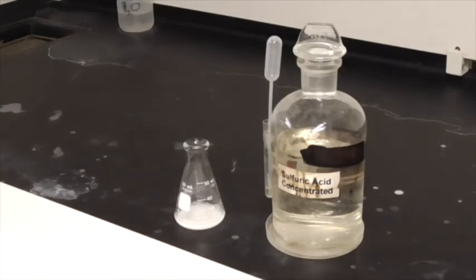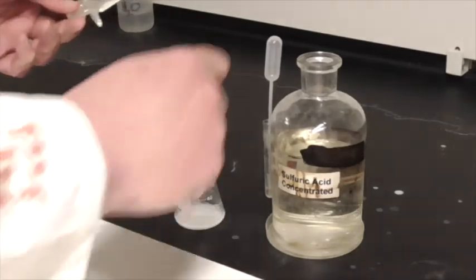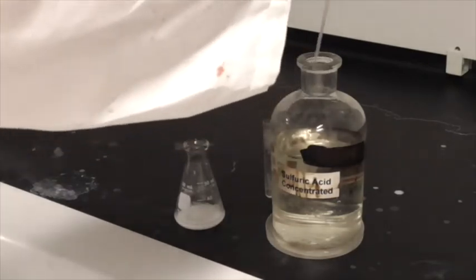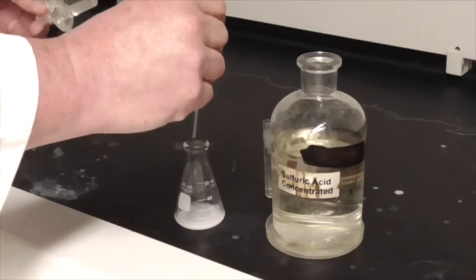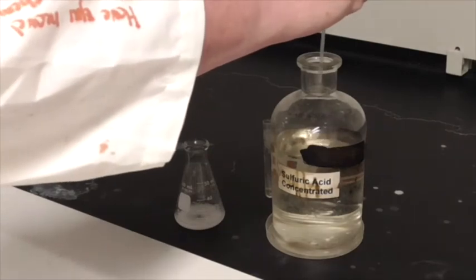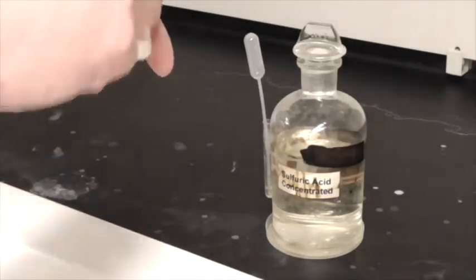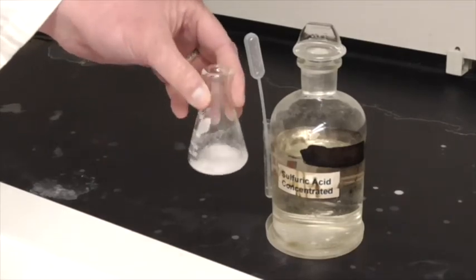So we're at the hood now, because that's where the sulfuric acid is. Sulfuric acid is very corrosive, and this is concentrated, so this is really, really corrosive. So we're going to not get any on us. So we just need to add 5 drops. 5. There's 5 drops. And we're going to swirl it around a little bit. And basically what we're going to do is take this over to our hot plate and heat it just enough to get it all to dissolve.